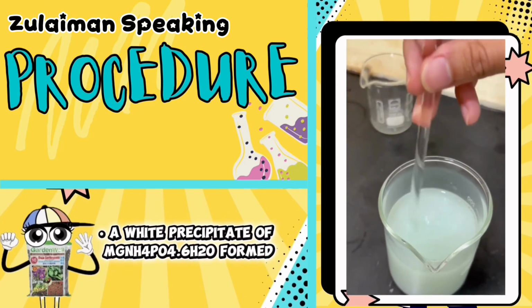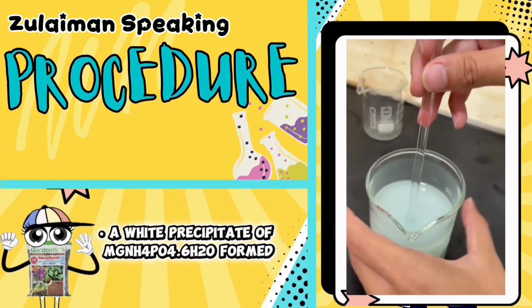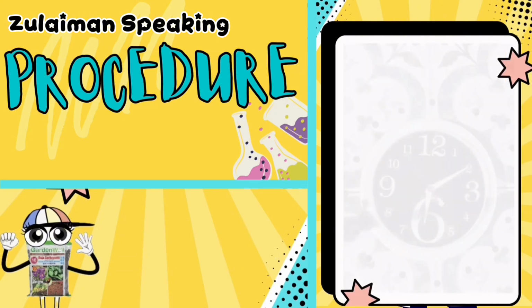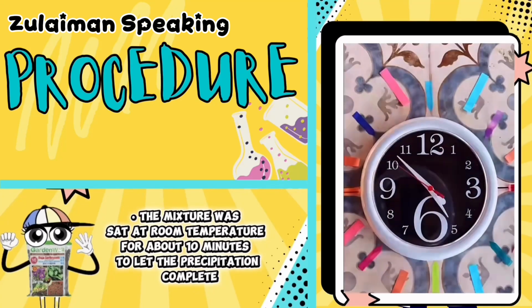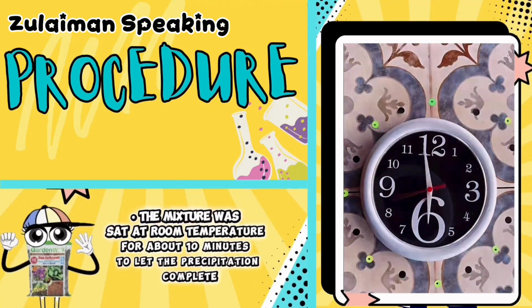Then, a white precipitate of magnesium ammonium phosphate hexahydrate will form. The mixture was set at room temperature for about 10 minutes to let the precipitation complete.